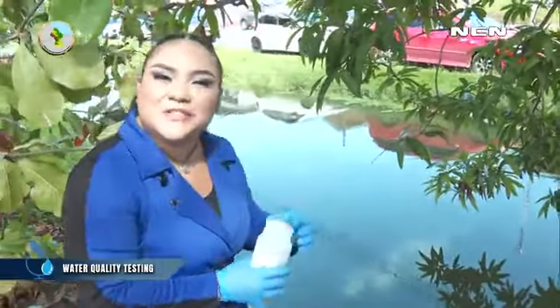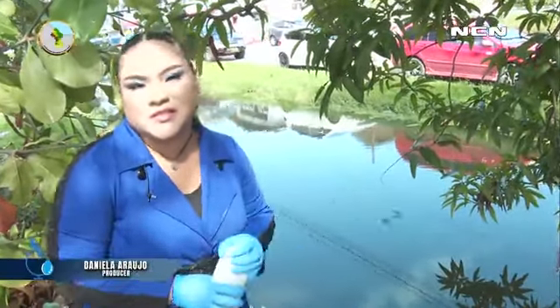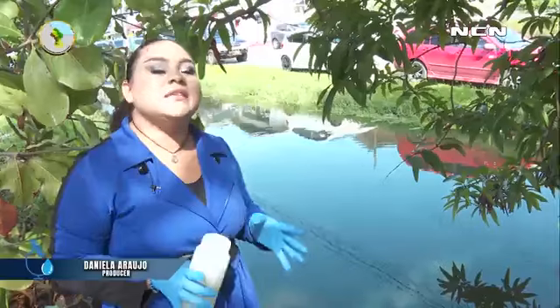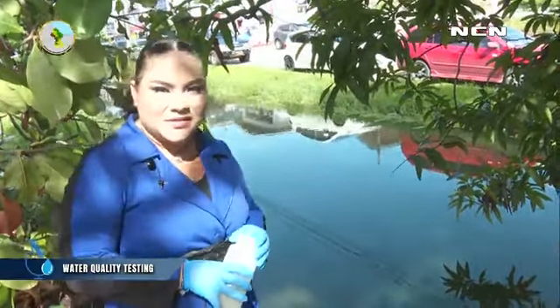Water plays such an essential role in our lives. We use it for drinking, domestic purposes, as well as recreational activities. Today we're going to be testing water to see how suitable it is for the purposes of farming as well as its drinkability.